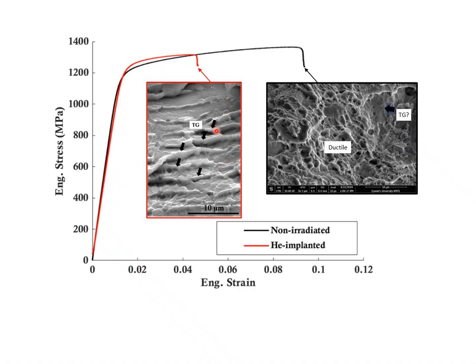You just have defects in the material that you weren't aware of. Now, you may not have been aware of them because you didn't have the resolution to image them with whatever imaging system you're using to begin with. Or even if it was a TEM, which would be high resolution, you should be able to see them. Even so, features like these are not necessarily uniform. You might see them in some grains, but not in others.